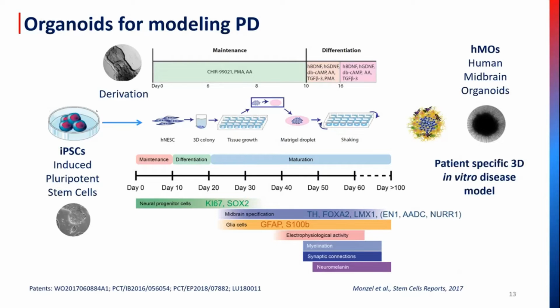Parkinson's disease. And in this case, what we do is we start with patient and healthy cell samples that were reprogrammed into this pluripotent stem cell stage. And then we further differentiate those into an intermediate neural precursor cell stage, which are still stem cells, but already committed to differentiate in the dish into brain-like structures. And these are the cells that we use as the starting population for generating these organoids. And how this works is basically we place a certain number of these stem cells into U-bottom shaped plates and let them self-assemble into spheres.